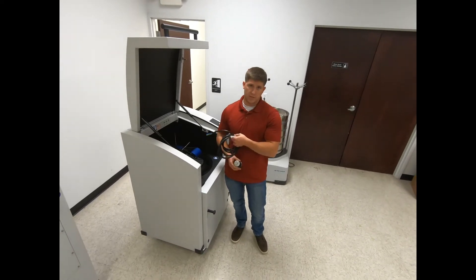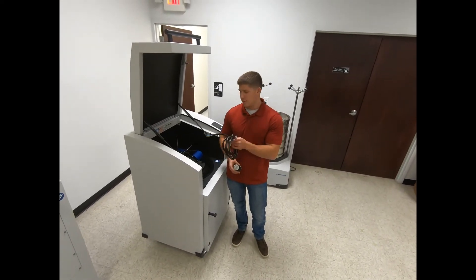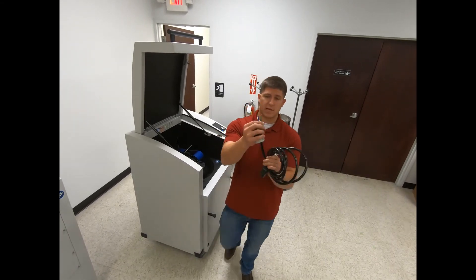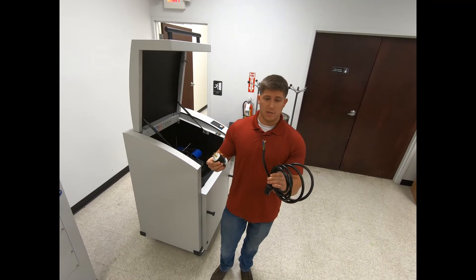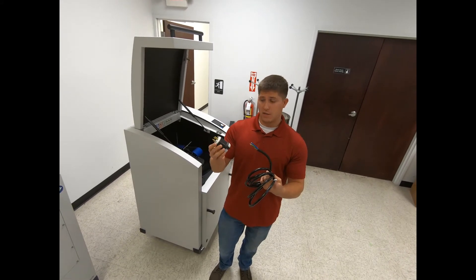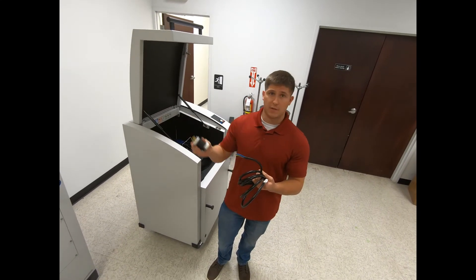Once you have the unit rolled into the designated area, the unit actually comes with the power cord pigtailed. It does not come with a plug, so you're going to want to get your electrician to install the plug of their choice into the correct outlet for you.